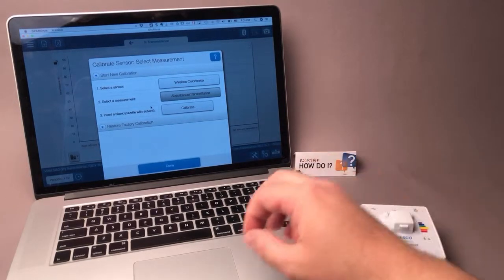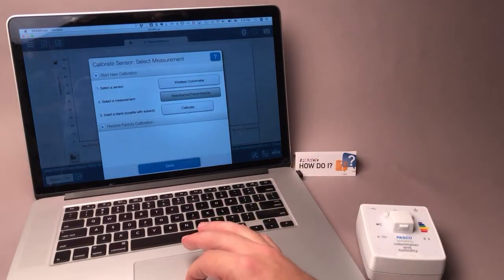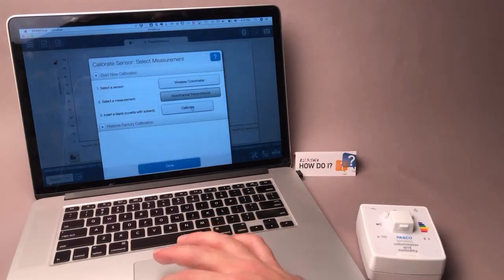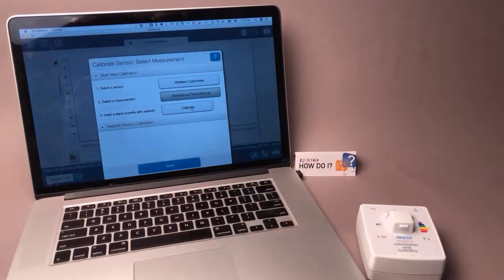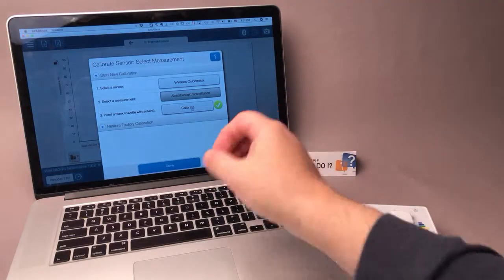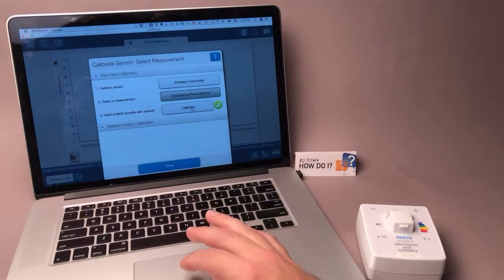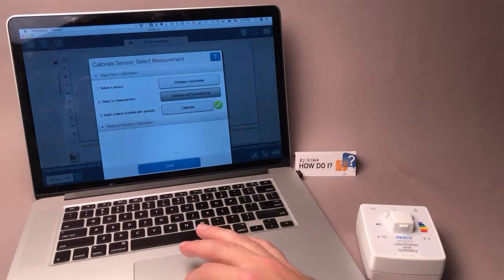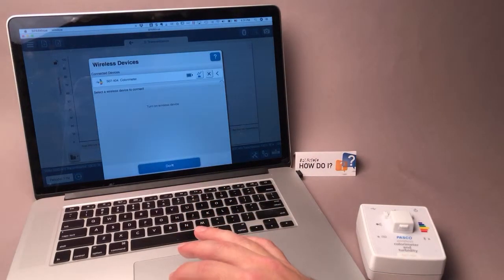I will close the lid, and in SparkView, choose Calibrate. The green checkmark indicates that the calibration has been successful. I'll press Done.